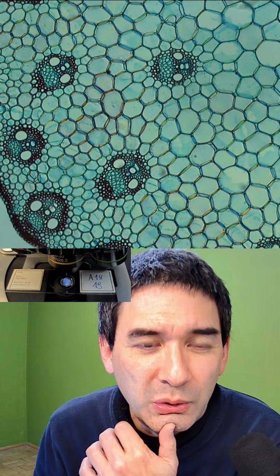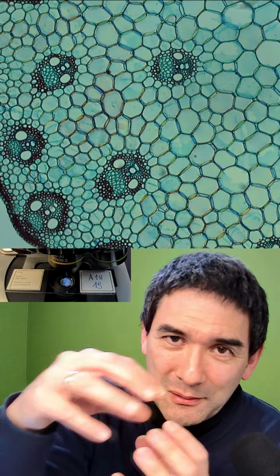So this is one of my favorite ones, and I've actually also made one of it, must have been 25 years ago now. It was my first microscope. I made my own microscope camera using a webcam. I disassembled a webcam, constructed a separate container, and put it on my microscope.